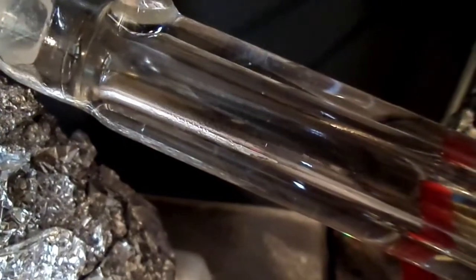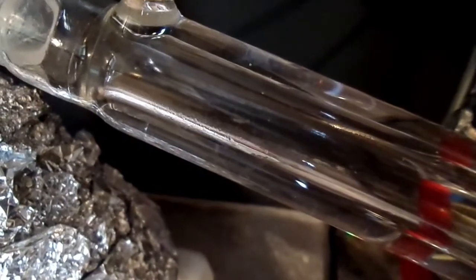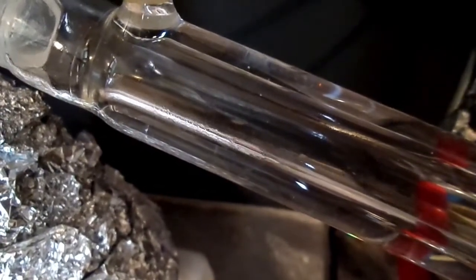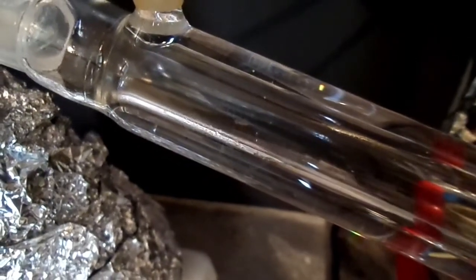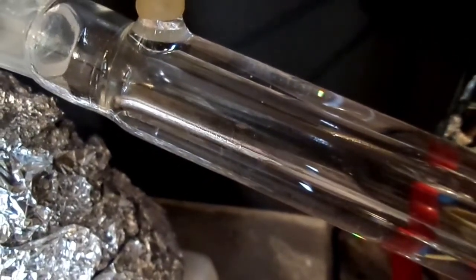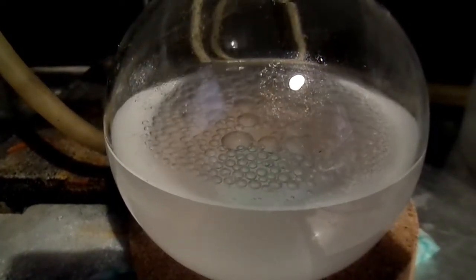Once the solution started boiling, we can see some oily droplets of benzonitrile coming over with the water. This was continued until no more oily droplets were apparent in the distillate. Distillation took 7 hours in total.